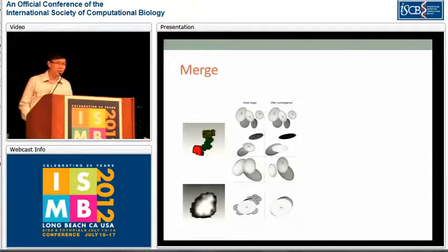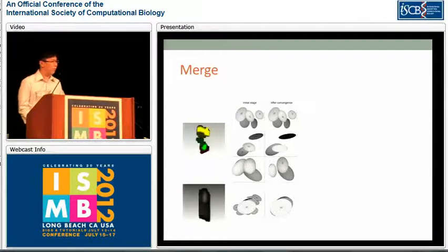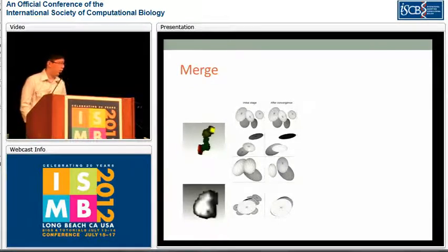I can think of some reasons, and it's because of our signals. If you look at the signal very carefully, it doesn't look like it's generated from one Gaussian distribution. Sometimes the signal can have very strange shapes. For example, if you look at the upper image, you can see that from the front side it looks okay, but the microscope usually has a bad Z resolution. Therefore, the Gaussian mixture model might not give us the correct result. So what should we do?